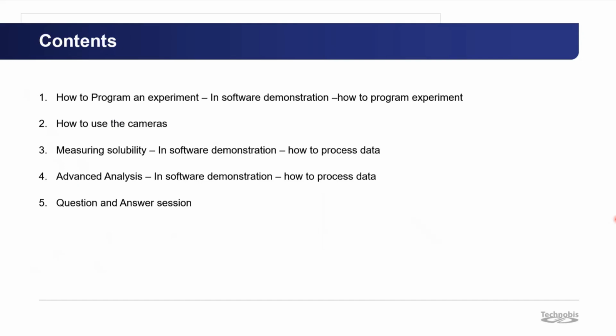So the contents of this webinar will be initially how to program an experiment, and this will consist of an in-software demonstration showing you how to program a crystallization experiment. The second step will be how to use the cameras. This will be done through slides showing you the factors and settings that can be altered in order to obtain the optimal images of your particles.